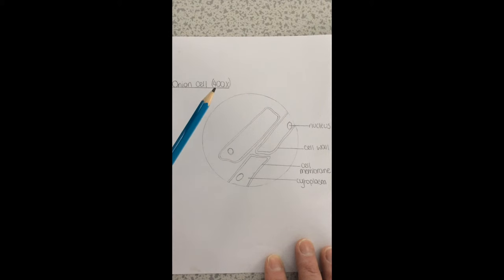Now to work out the total magnification, all I do is times the magnification of the objective lens, which in this case was times 40, times that by the lens in the eyepiece, which is times 10. And of course, 40 times 10 gives me a total magnification of times 400. So the image that I saw under the microscope was 400 times bigger than the actual cell size.